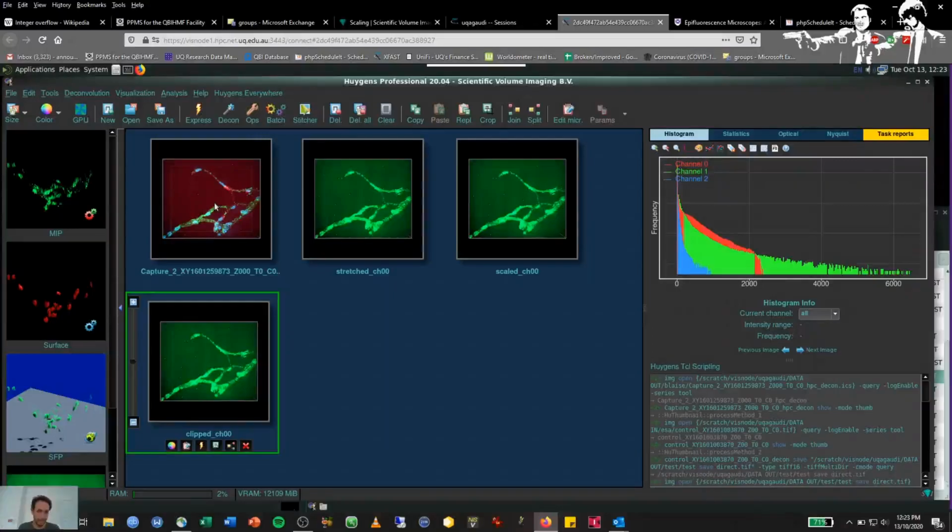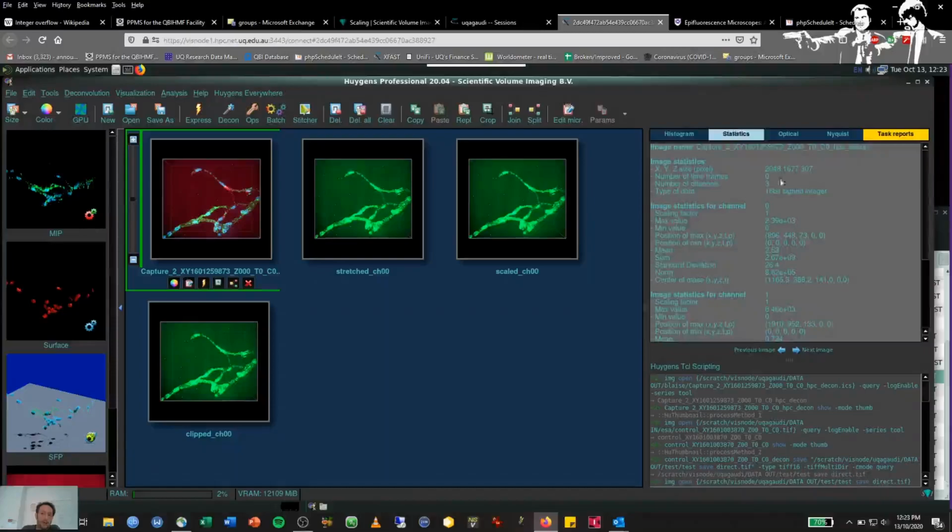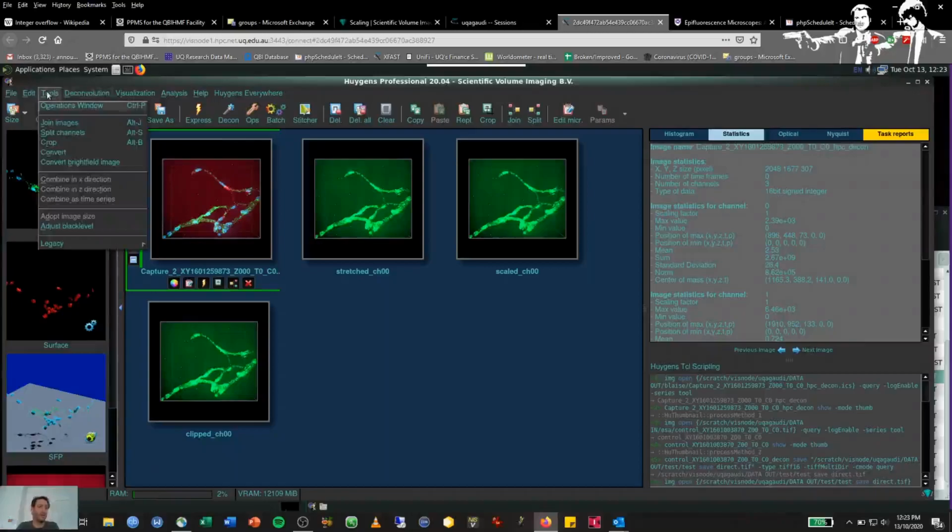You just clip it. Now, interestingly, if you want to clip your image, then when you take your 32-bit floating point image initially, rather than transforming it into a 16-bit signed integer, you can just transform it into a 16-bit unsigned integer, and that will effectively bypass the rescaling option.